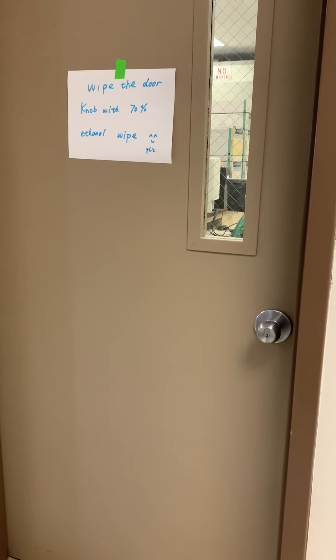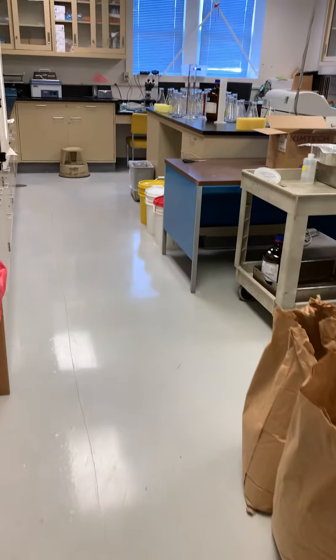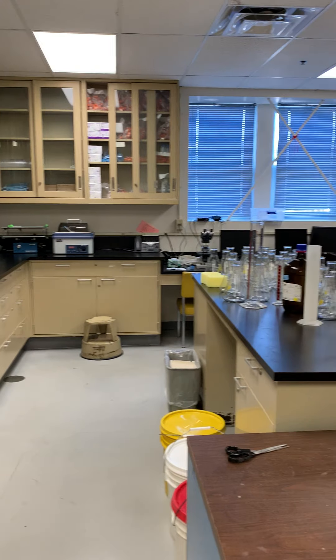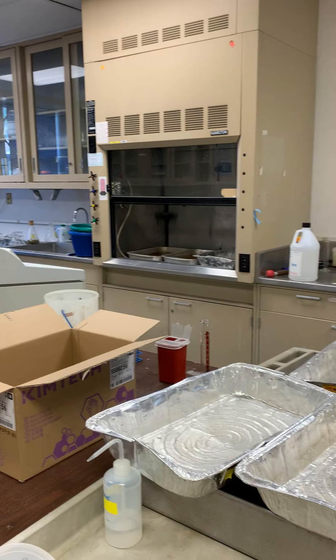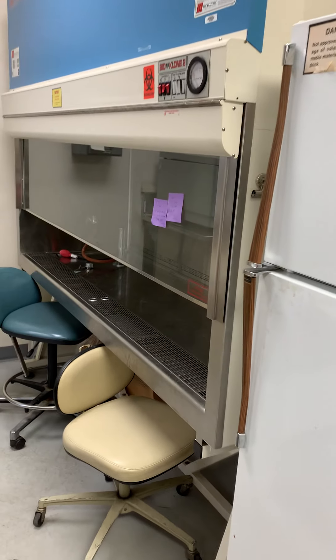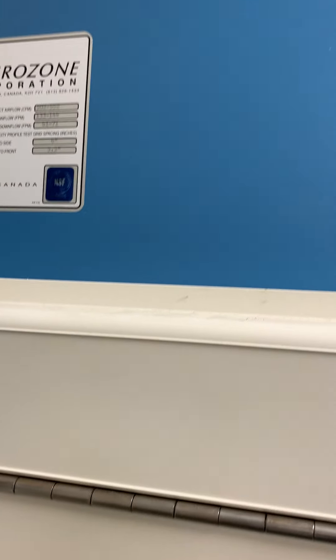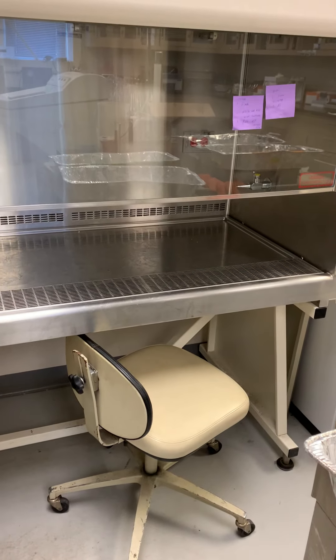I have two research labs. One is for the production of mycotoxin culture. In this room I have a biosafety hood for fungus inoculation.